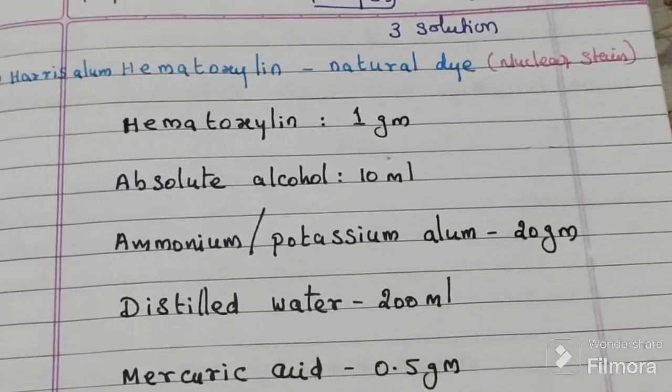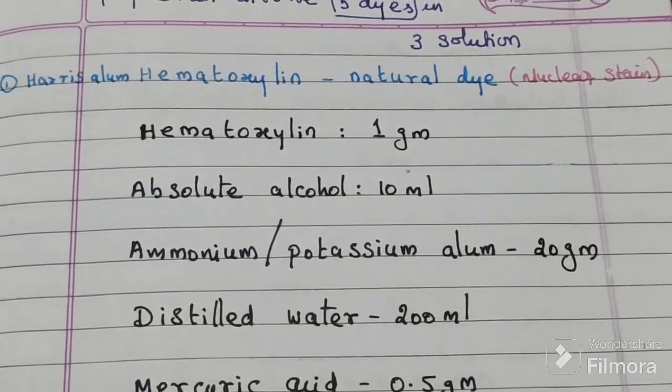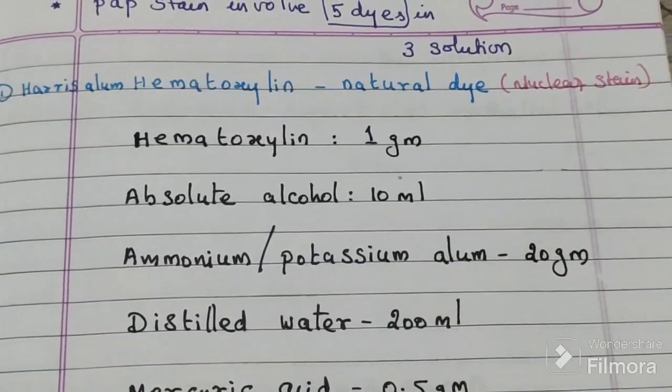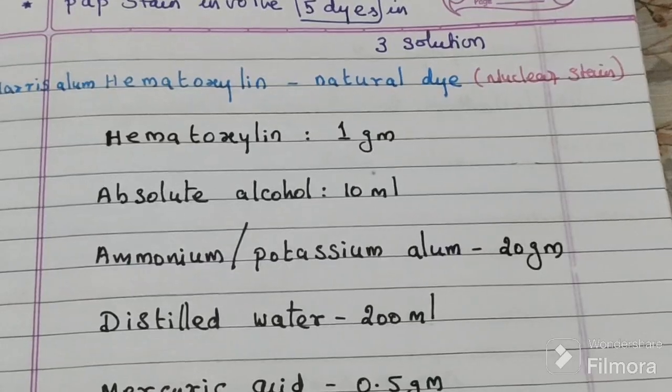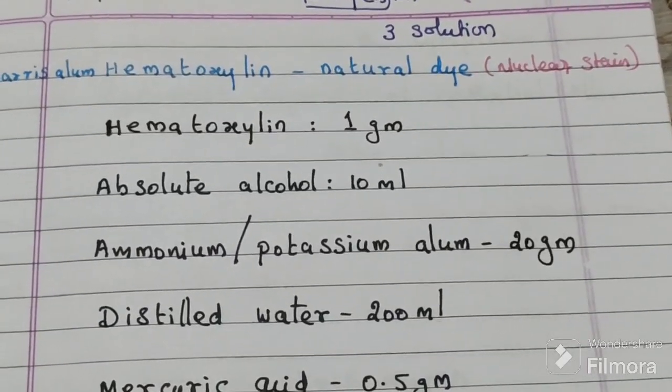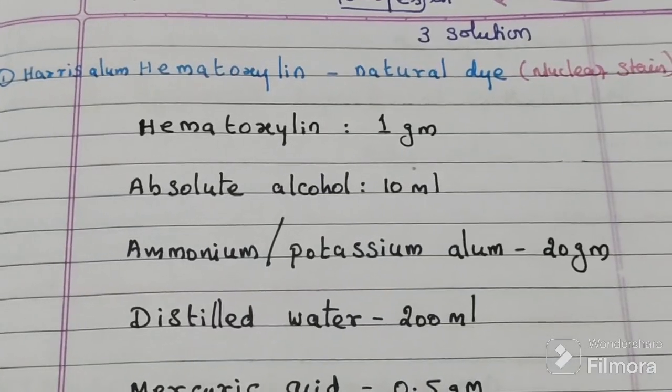Here we mainly use Harris alum hematoxylin.